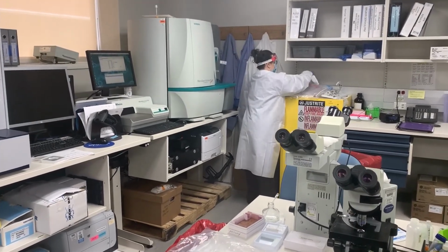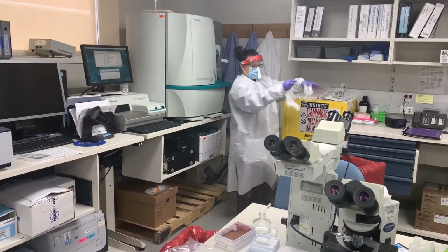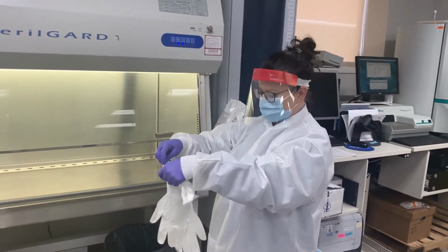And then her last step is that she's going to put on elbow length gloves to protect her forearms from anything inside of the biological safety cabinet.